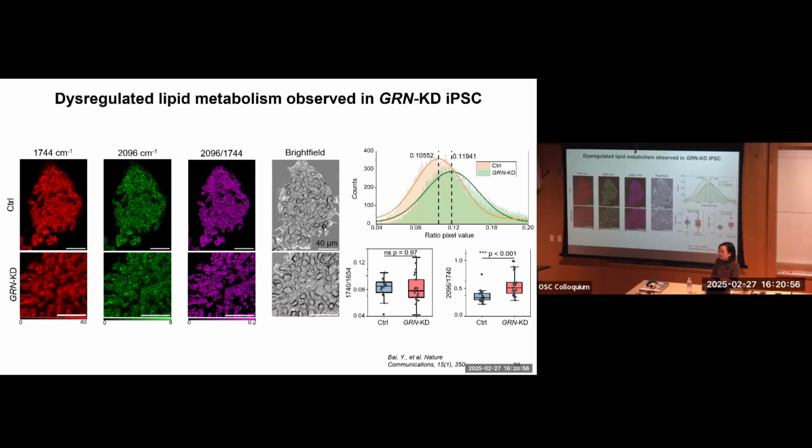Yeah. One other question. What's the lipid metabolism, as opposed to glucose metabolism? So they consume lipid for food? Yeah, that's also a very good question. So here we are feeding fatty acids, which are small molecules, and the end products we are detecting are actually lipids. It's a bunch of fatty acids assembling together to form a cell membrane, if you remember the double layer structure, or lipid droplets, which store energy. They are little dots in our cells that basically store fat. So we are detecting the end products, but we can also do other metabolism.